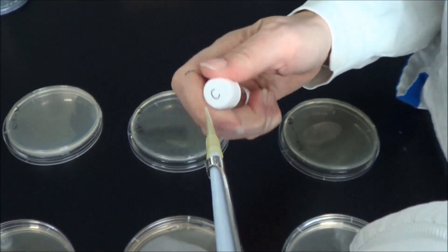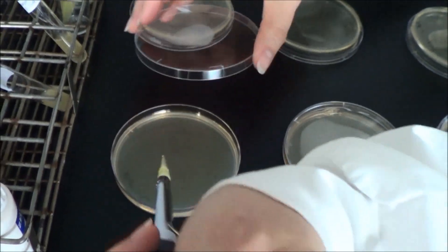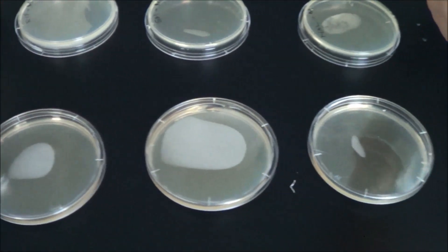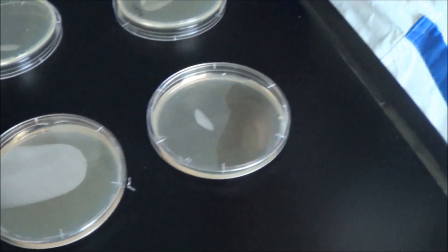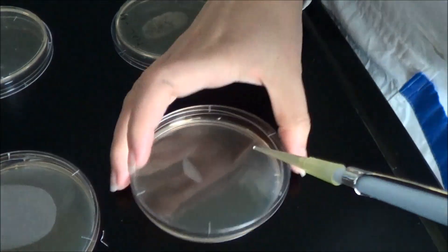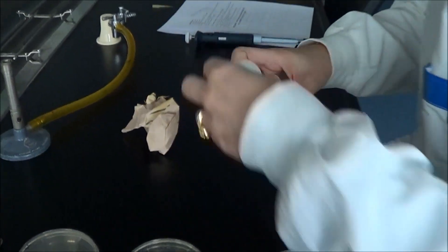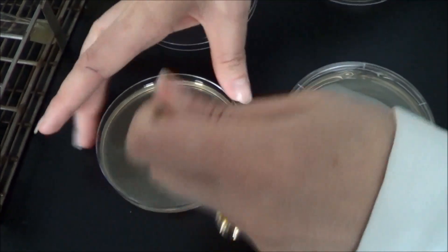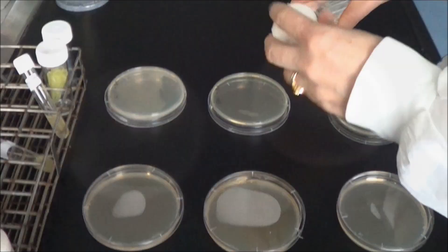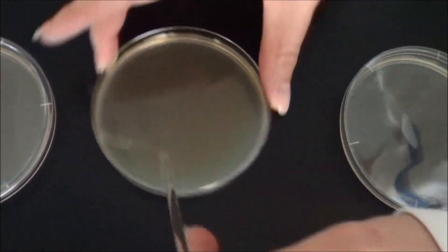Now add 0.1 ml of your control cells to your control plates. Then, using a glass spreader, spread the cells onto three different antibiotic agar plates. Work quickly or the liquid will dry into the plate before you have spread it.